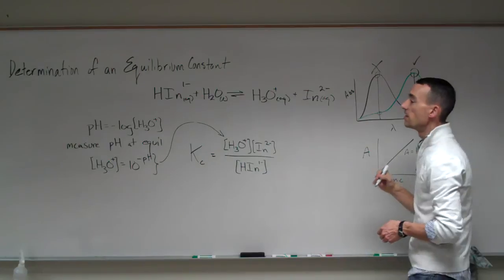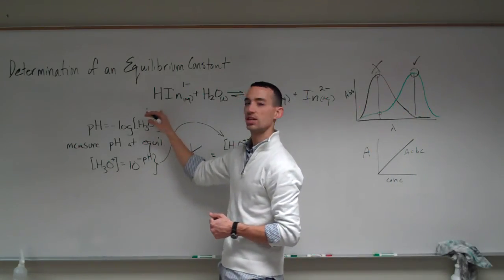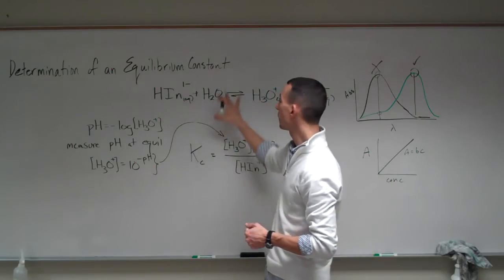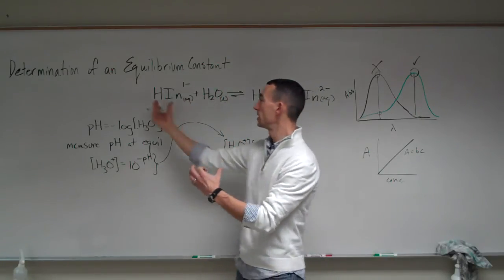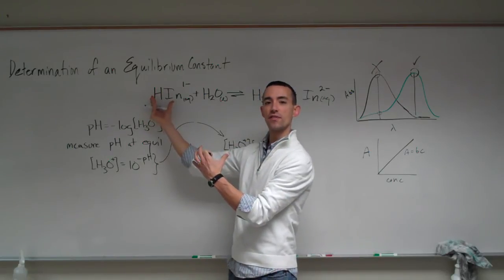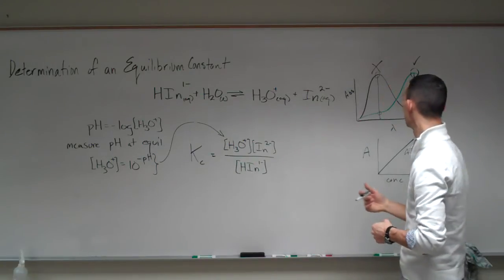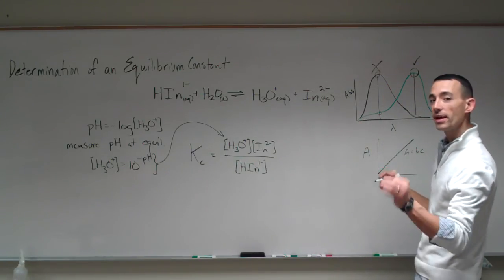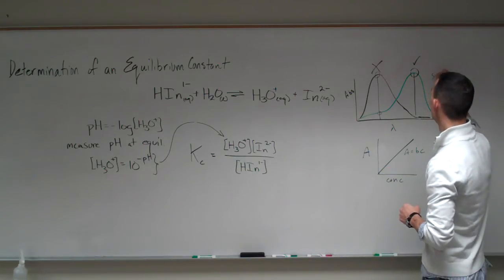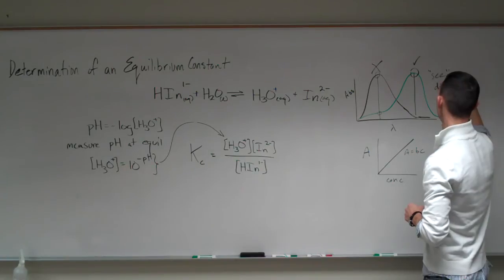Okay? Then you could totally deprotonate. Take all of the H's off. Now we don't see it in here, but if we replace the water with OH-, strong base would take all of these hydrogens off of the indicator and move us over to the product side. Okay? I believe you'll get this spectrum then. Pay close attention because you'll see, your eyes will see two different colors.